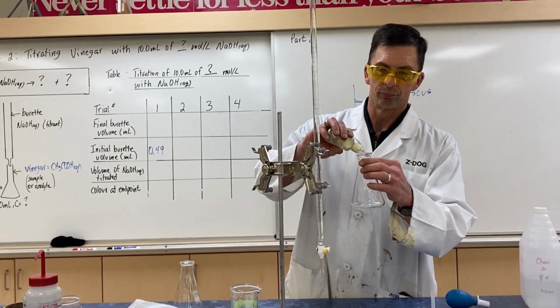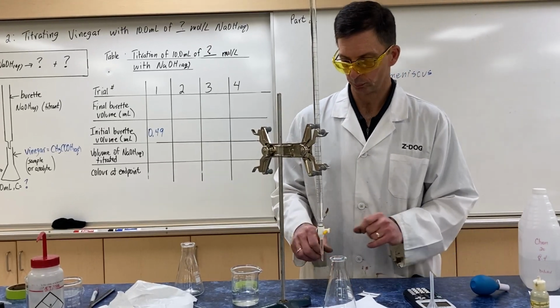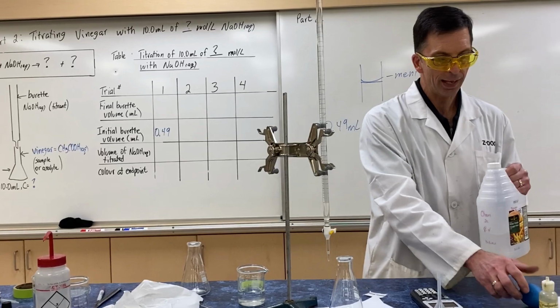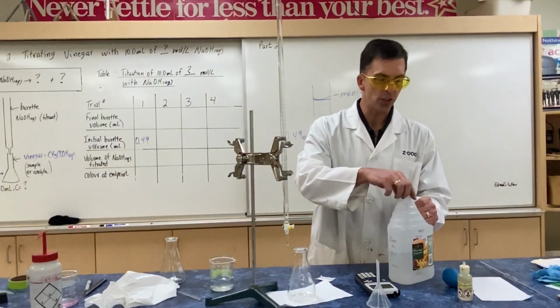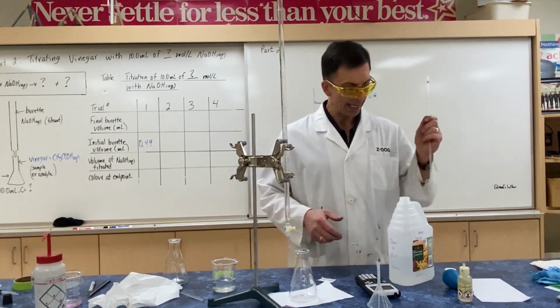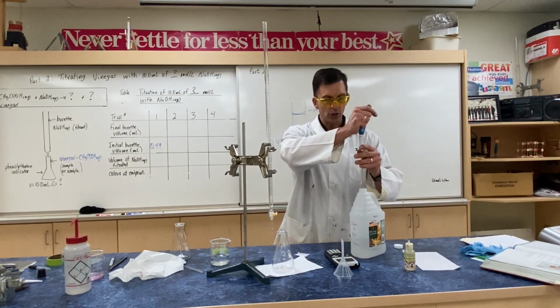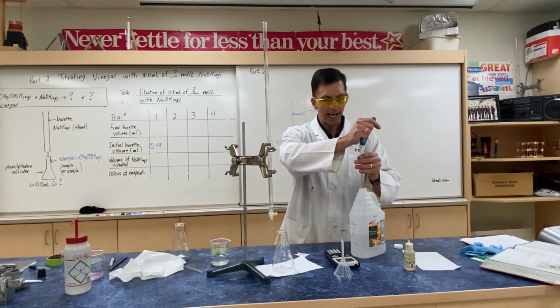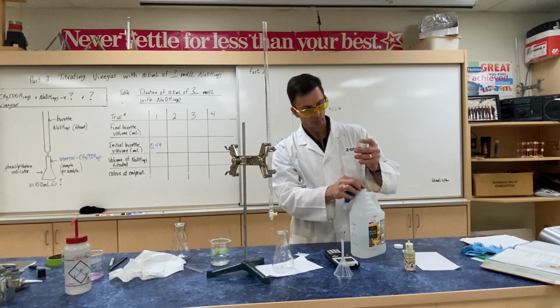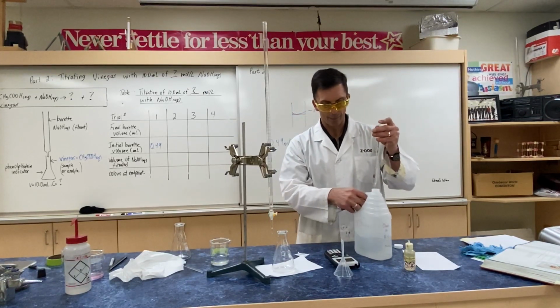Why does it turn pink though? I explained this in the video you would have watched on Friday, but remember, phenolphthalein has a color change between a pH of 8.2 to 10.0. As we're adding base to the acid, the pH is rising as the reaction is completed. At the first hint of the color change, the reaction is completed. There's no more acid to basically buffer the base.